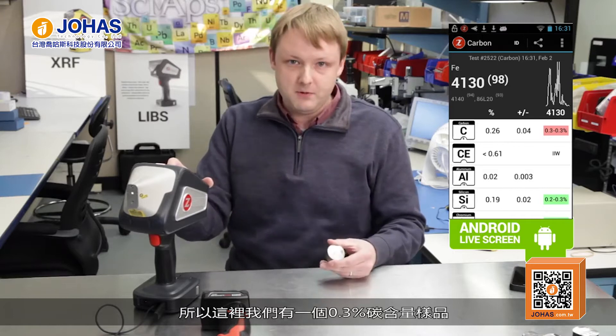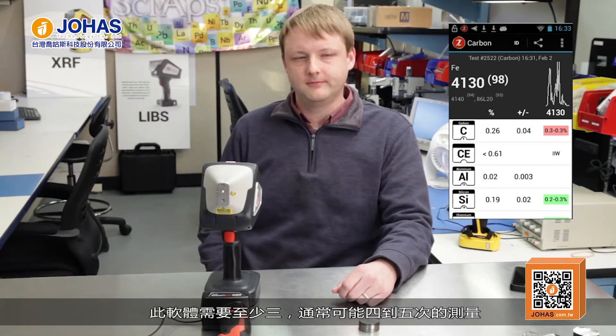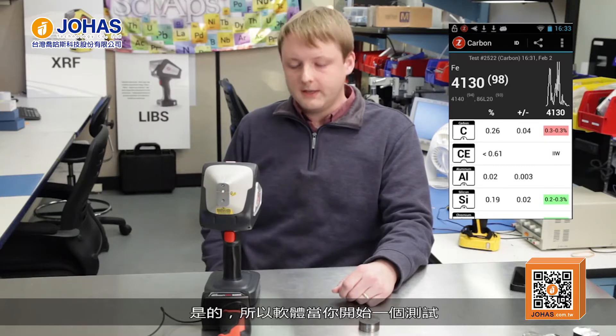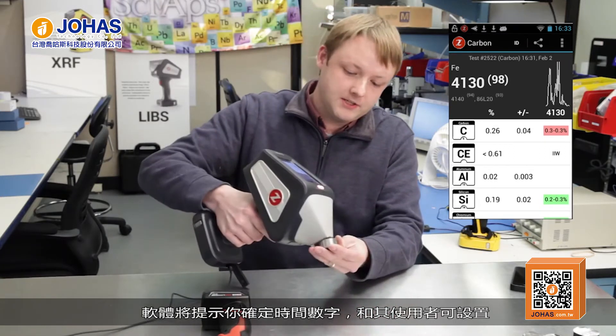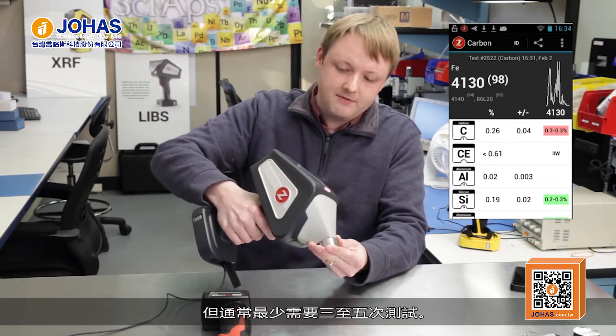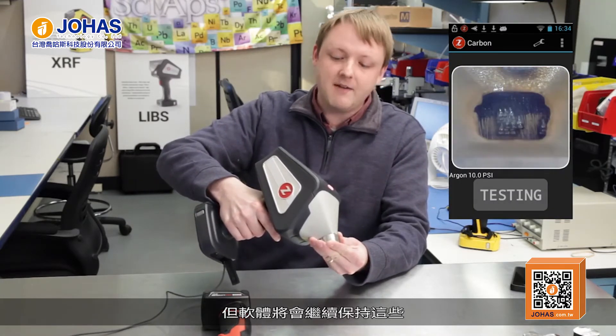It's applying some statistical analysis to basically all of the data that come in to make sure that you're only getting the most repeatable data for your carbon result. The sample has 0.3% carbon, so we're getting a reading of 0.26 plus or minus 0.04 — so that 0.3 is right within that spec. The software requires at least three, usually maybe four to five good tests to average. The operator pulls the trigger three or four times and then the software automatically averages each test.